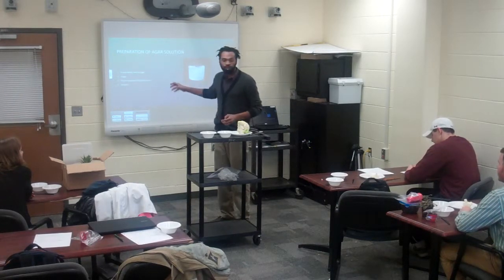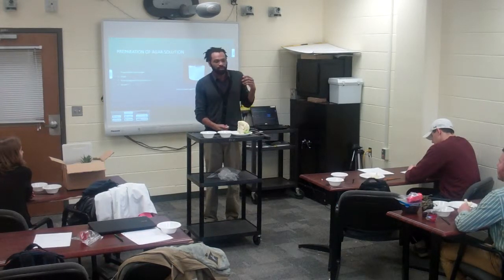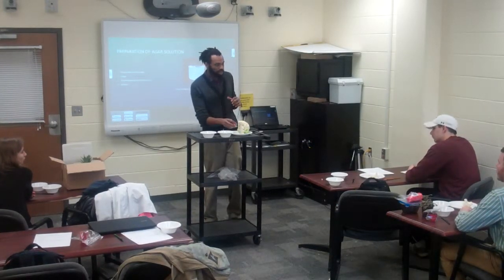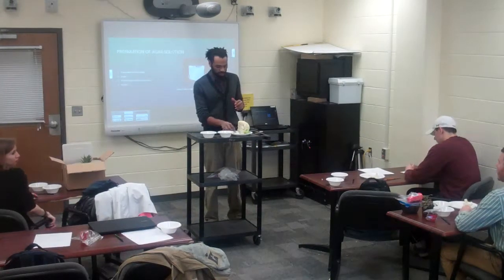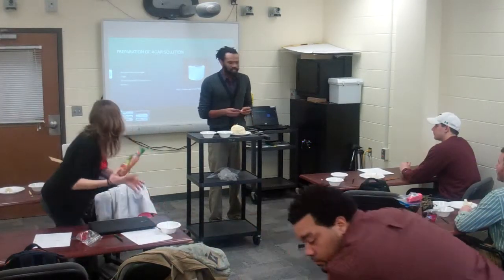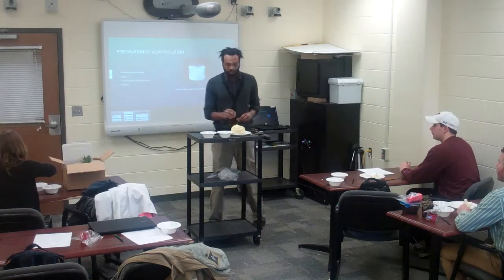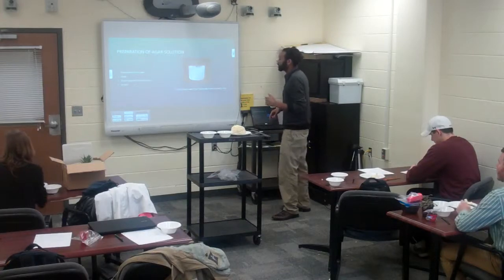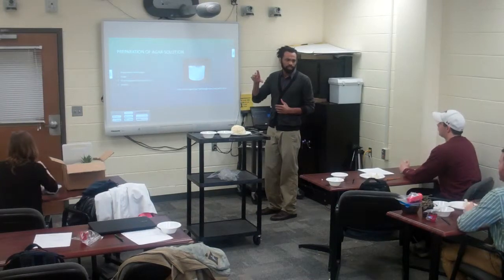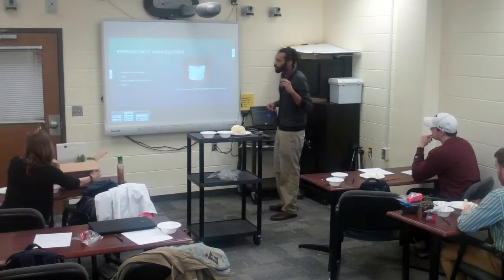All right, Murashige and Skoog solution. This is an important part because this is what helps it work. It contains all of the hormones that get this going, get this callus, and get this rooting. And the callus is one of the most important parts of micropropagation, because callus is indeterminate tissue that becomes the roots from the ends of the shoots. And kinetin is another hormone that goes into this mix. It's a pretty small part. You end up having to take out some of it, dilute it, and then mix it in. It's a very small amount.